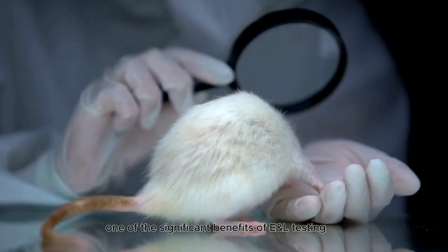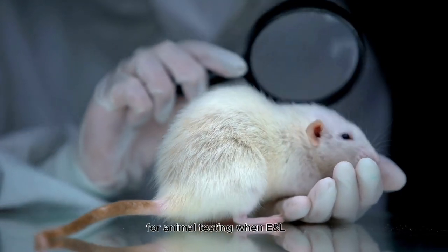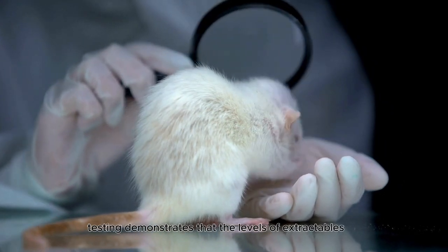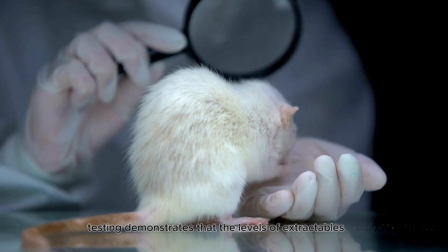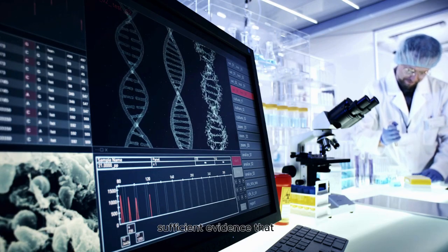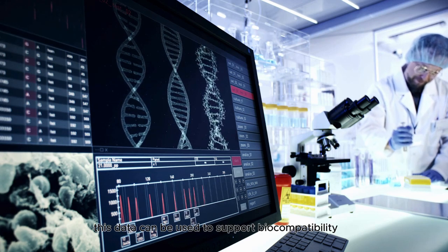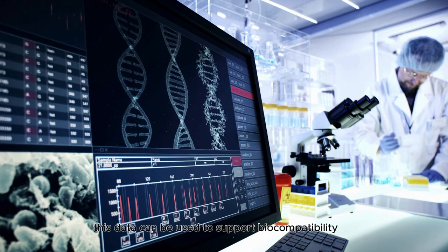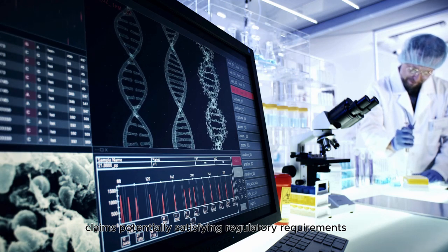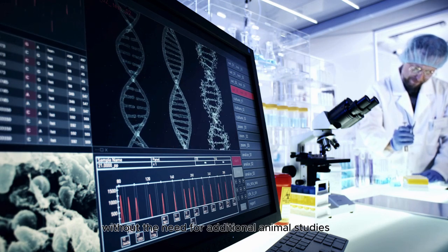One of the significant benefits of E&L testing is its potential to reduce the need for animal testing. When E&L testing demonstrates that the levels of extractables and leachables are below toxicological concern, it provides sufficient evidence that the device is unlikely to cause harm to patients. This data can be used to support biocompatibility claims, potentially satisfying regulatory requirements without the need for additional animal studies.